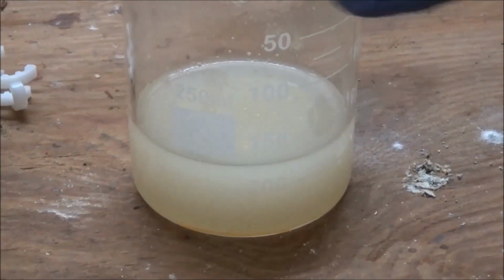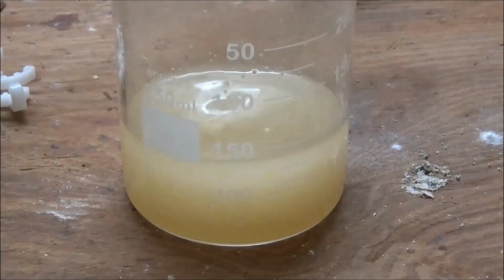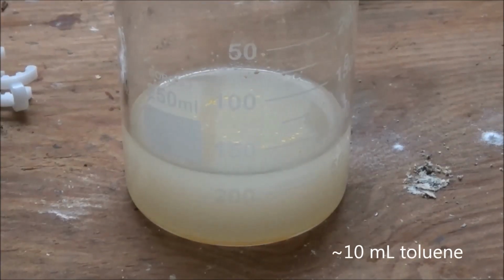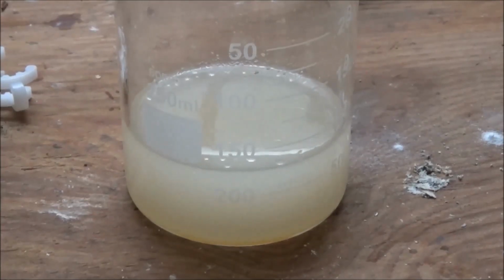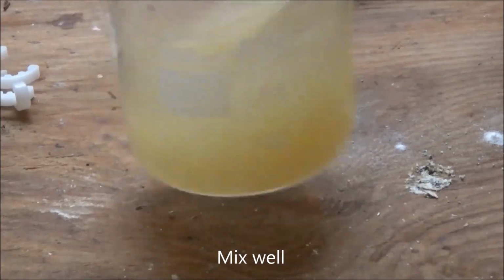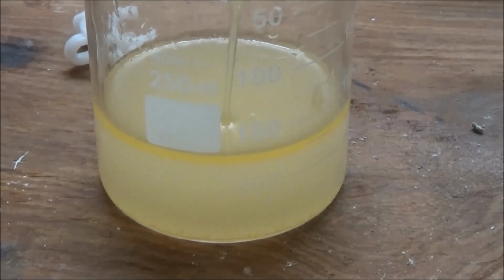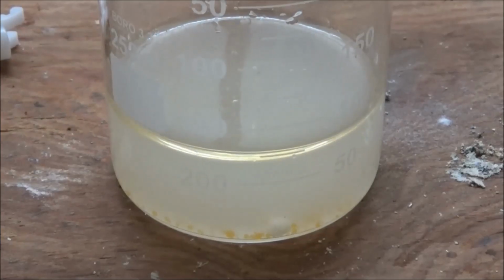When done, some dense yellow blobs remained on the bottom and floated around in the solution. Because of the small volume, the toluene extraction which followed was done in the beaker. I used approximately 10 milliliters of toluene for each washing. The toluene absorbed the blobs and was pipetted off. The extraction was done a total of 2 times.